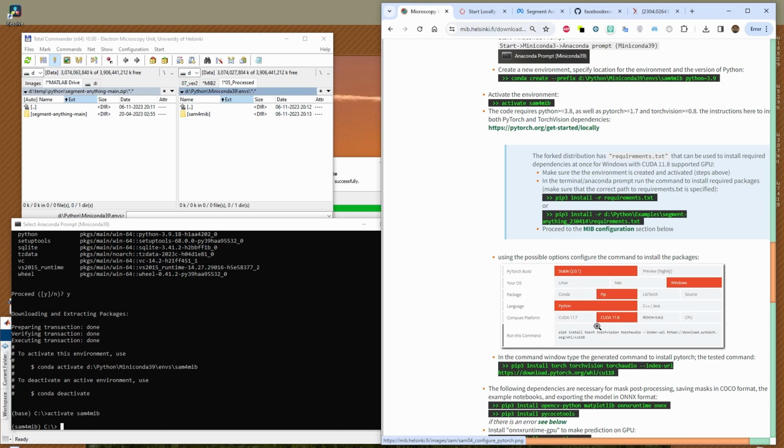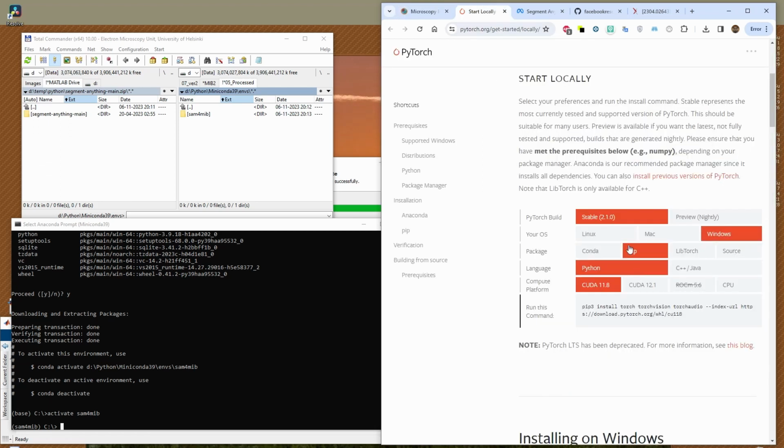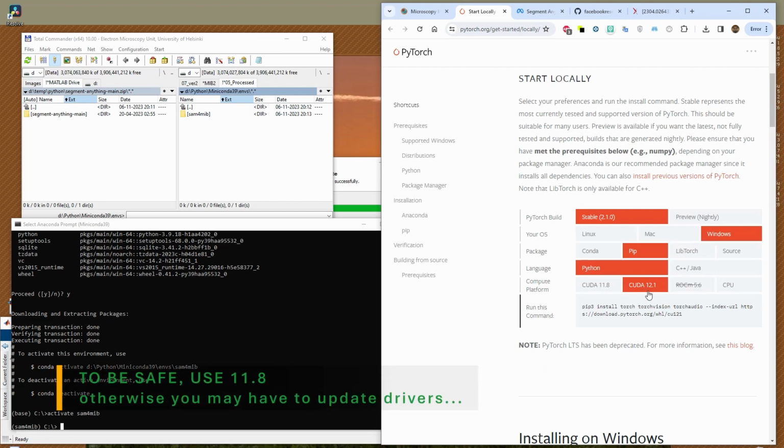The important part is that you install it from pip, not from conda, because as far as I tried, there were some compatibility issues, and depending on what kind of CUDA compatible driver you have, you can use this or the other. Mine should be compatible with this, so I will try this one now. I haven't tried it before.